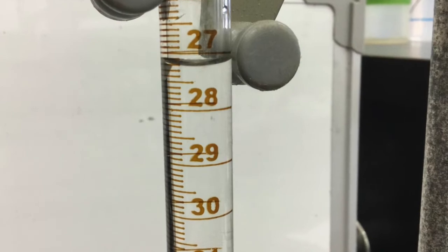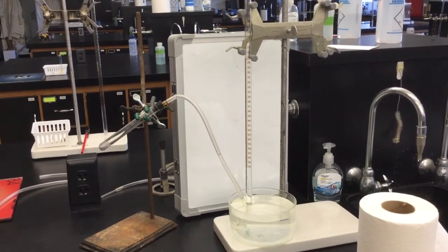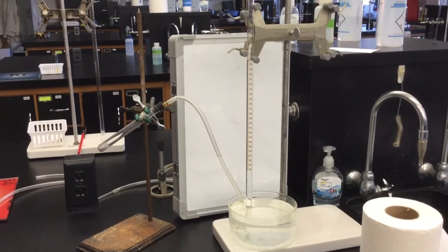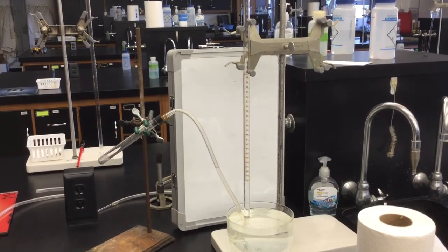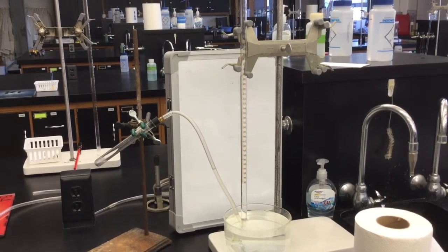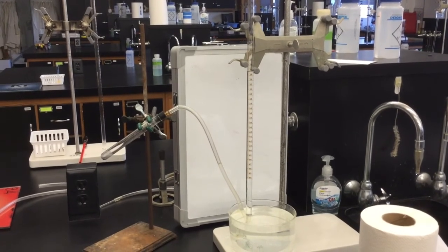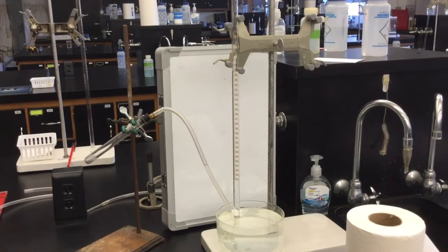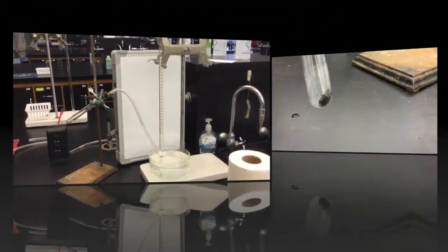At this point, you will need to redo your equipment so that you can set up for a second and then a third trial. So you will want to refill the eudiometer so that you make sure that you don't go past the point where you can measure the amount of gas in there, remembering to leave about an inch at the top. Make sure that you fill the tube again with water, and be careful of touching the stopper and the test tube until they are cool enough to touch.